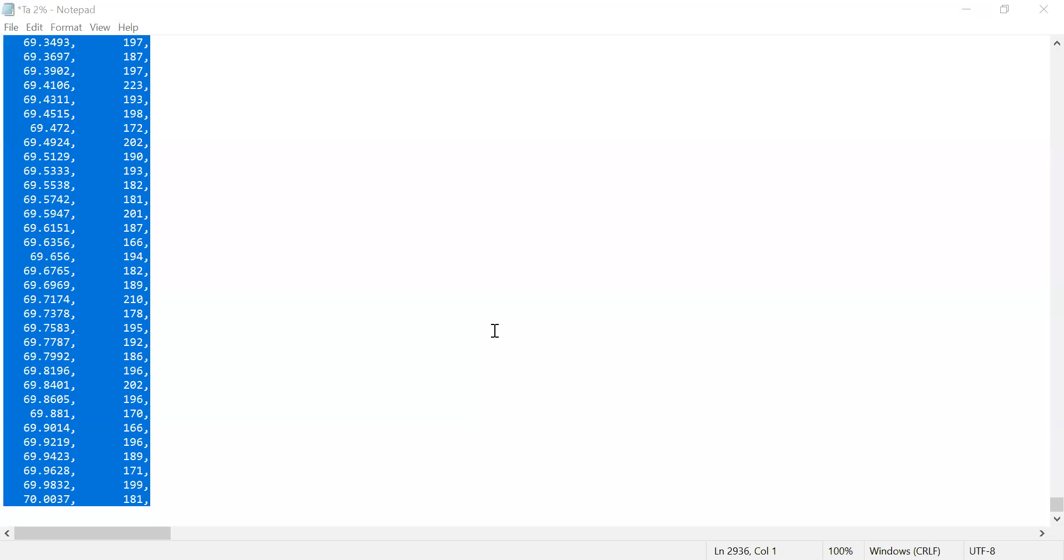Hello students, in this video I want to show you how to plot raw XRD data in Origin software. Here is raw data having a comma everywhere, so this comma doesn't allow you to plot this data in Origin software.